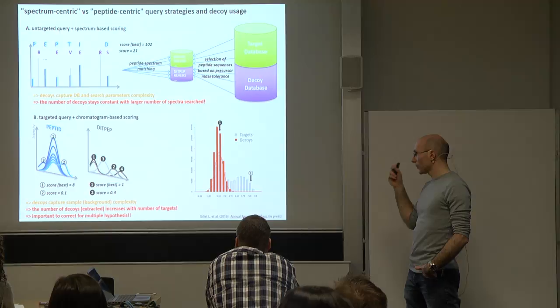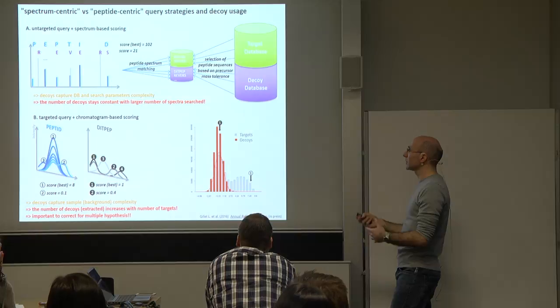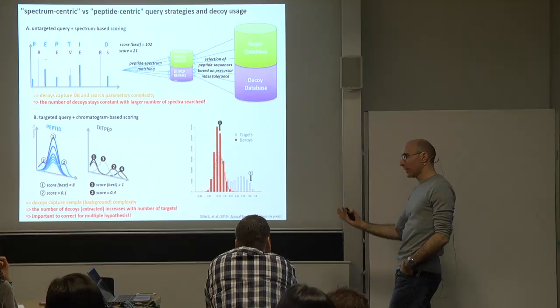Correct for multiple testing hypotheses, this is very important. And this is what we call now targeted, what we used to call targeted extraction of the data, and now that we try to rename peptide-centric querying of the DIA data.